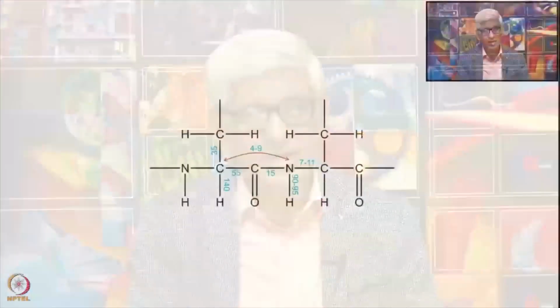So, we will stop here and we will explain a little bit more about some of these pulse sequences to give an idea of how the transfer happens in these pulse sequences as an illustration. We are not going to discuss every experiment, but I will take two illustrative experiments to show you how the manipulation is done through the pulse sequence. I think we will stop here.